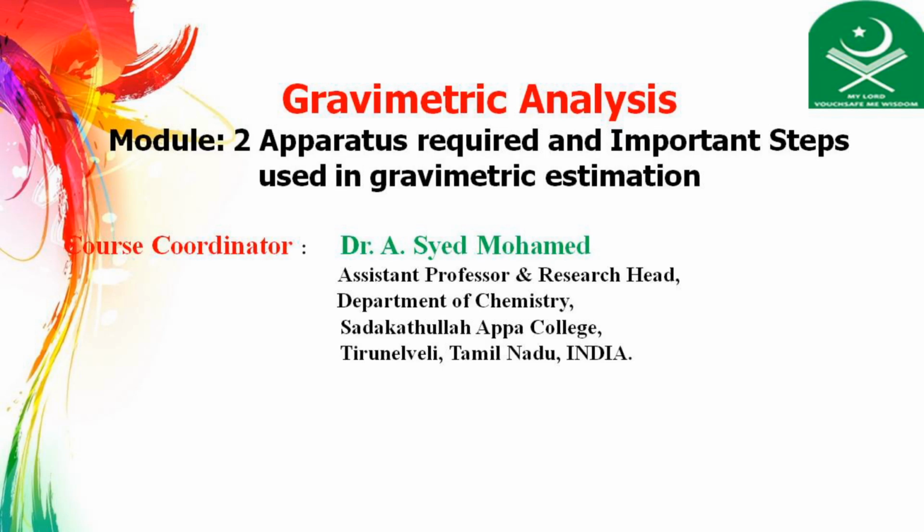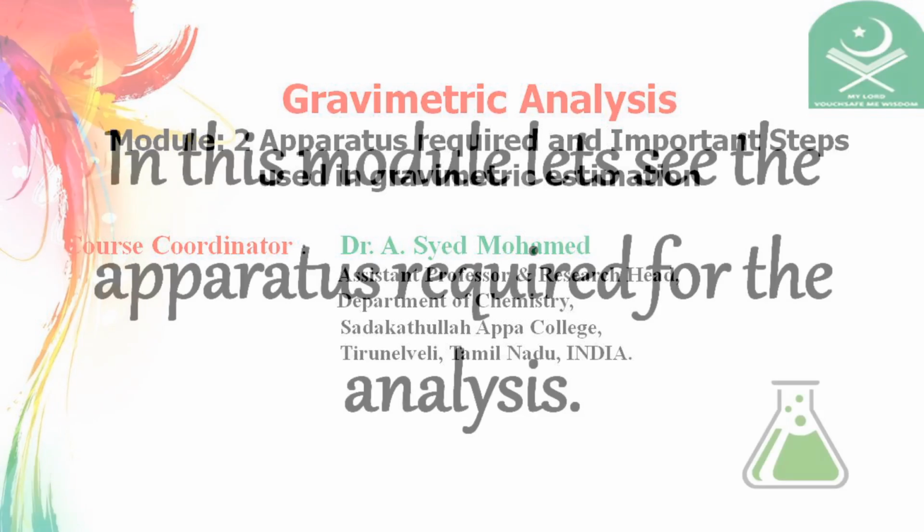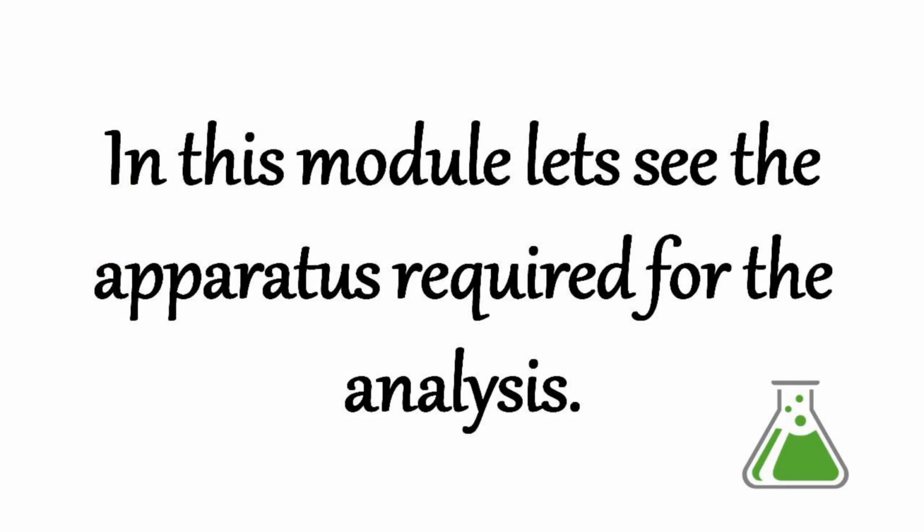In this module, we are going to discuss the apparatus required for gravimetric analysis and important steps used in gravimetric estimation. So let us discuss the apparatus required for analysis.